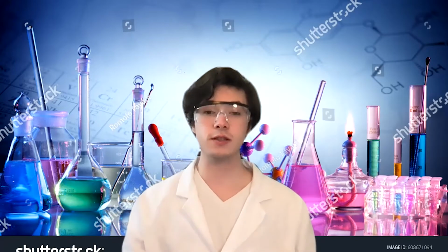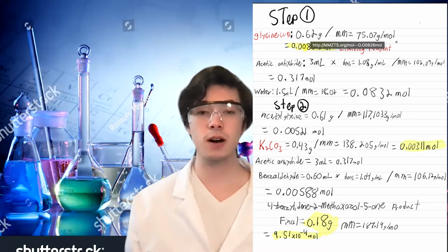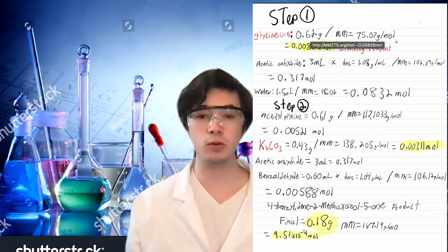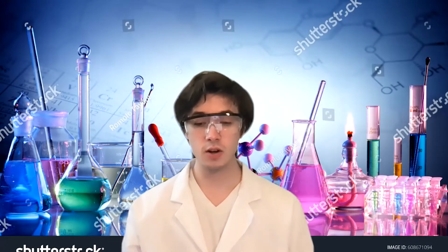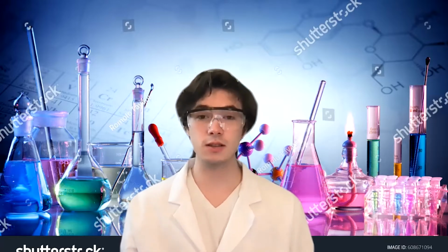The first step of this process is to find out the limiting reagent of each synthesis step. This is done by using the amount of each reactant we have, calculating how many moles we have in the reaction of that compound, and comparing that amount of moles to the amount of grams we have of all the other reactants in our synthesis. For the first step of the synthesis, glycine is the limiting reagent. And for the second synthesis step, we have potassium carbonate.